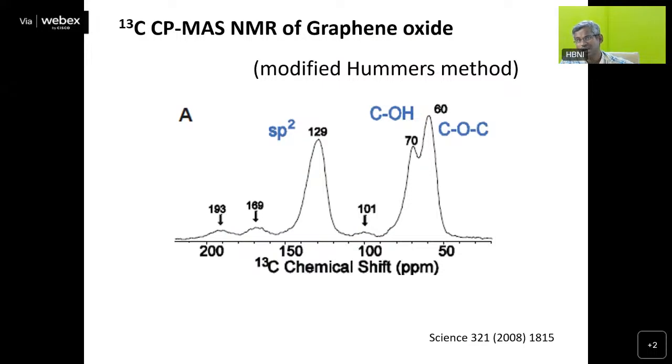Now, let us do a slightly different experiment called a correlation experiment. Probably in solution state you might have studied heteronuclear correlation, HETCOR. Then homonuclear correlation is also there. In proteins and other organic molecules, they will always try to correlate the proton NMR signals. So that is a proton-proton, HH, correlation.